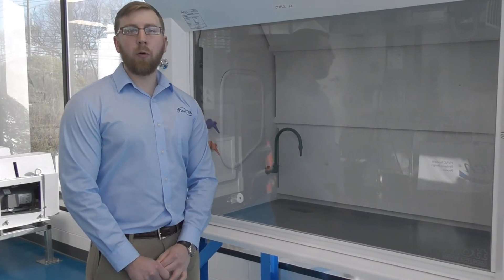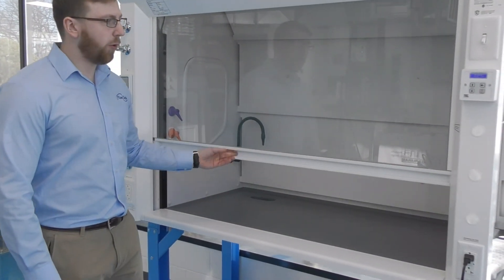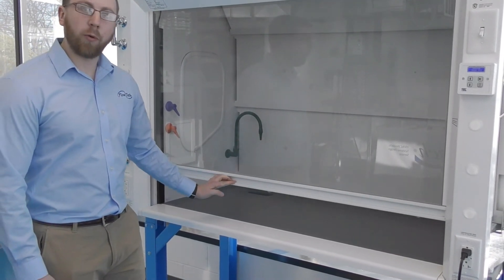We just showed you how to automatically open and close your sash, but don't worry — you can always use your sash normally like you would, putting it to whatever position, open or closed, you would like.